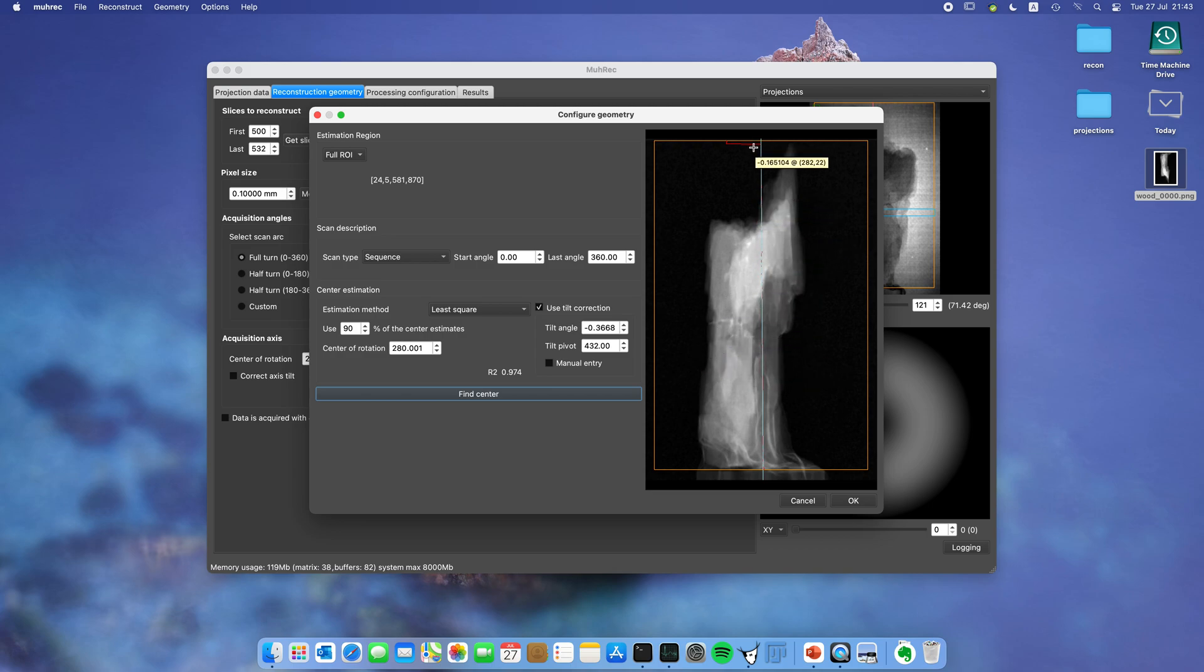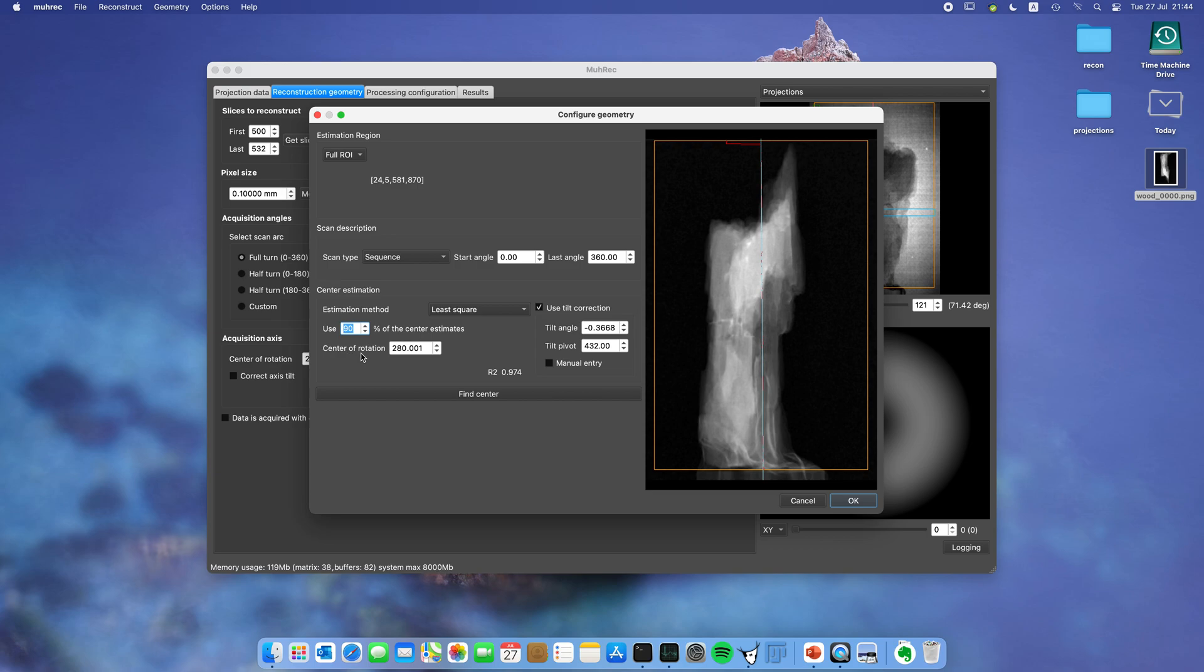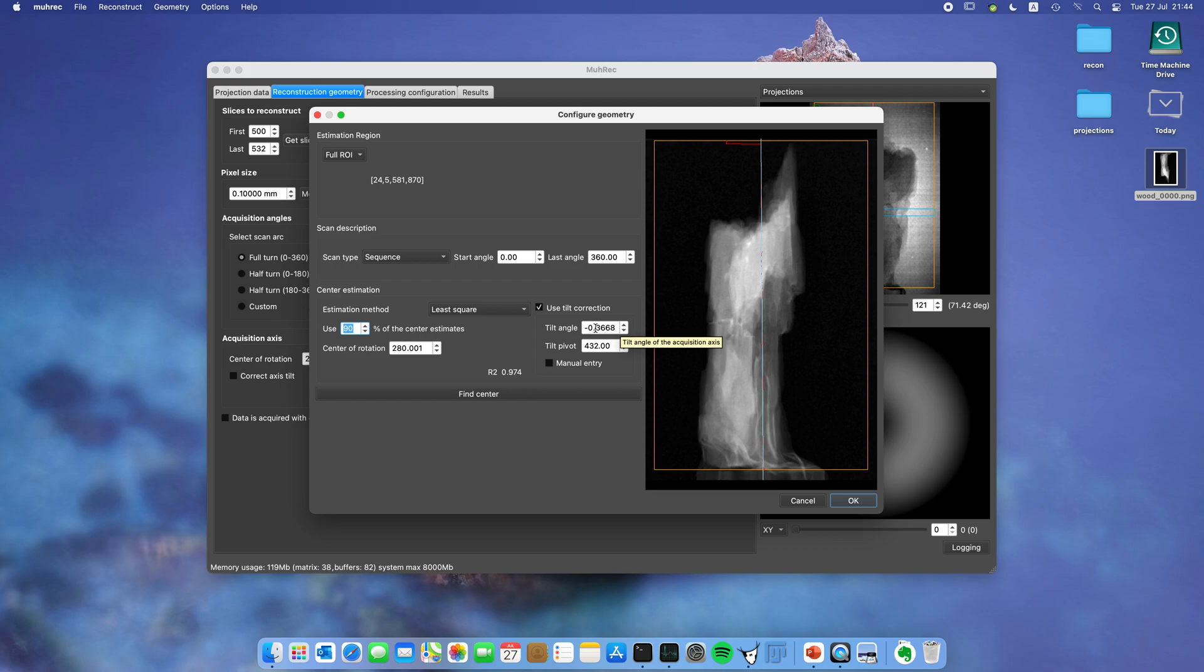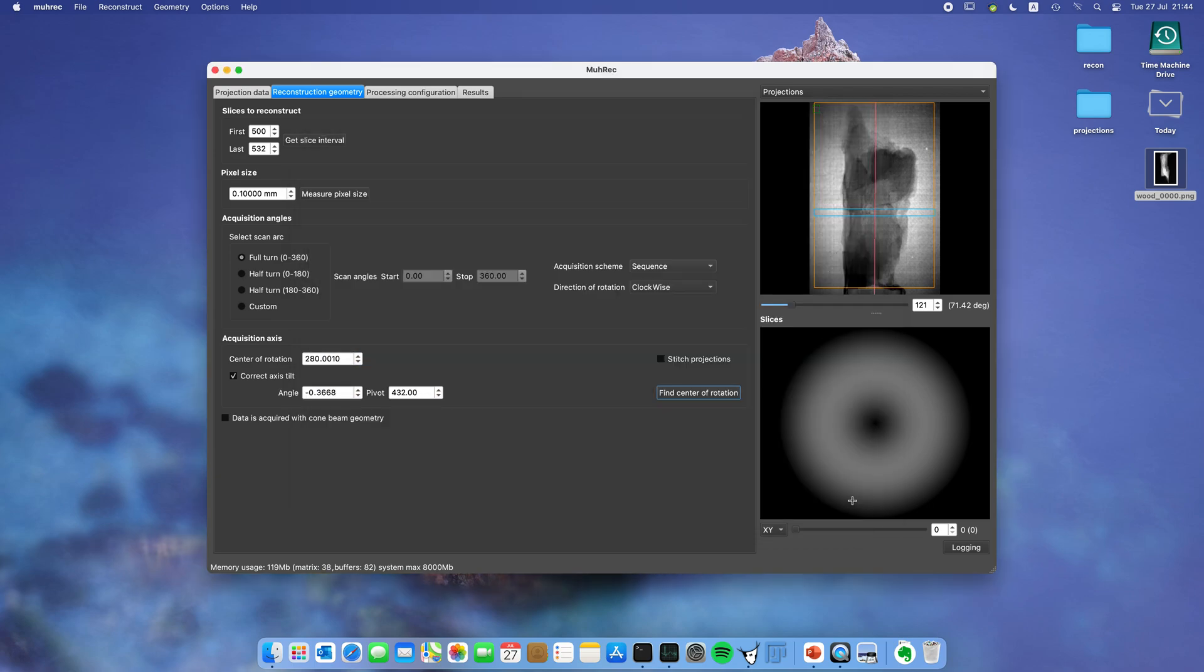Sometimes you have a sample which has a gap in the middle, and then the center estimate algorithm gets a little confused. You can get strange jumps up here. To handle that you can select here how many percent of the center estimates you want to use. In this case I've set the default 90 percent. Now I found a center rotation and a tilt angle. In this case it wasn't so well aligned, so I have a tilt of 0.36 degrees. The pivot point is the point in the projection where this tilt is rotating around. Usually you shouldn't change this value. Let's press OK.